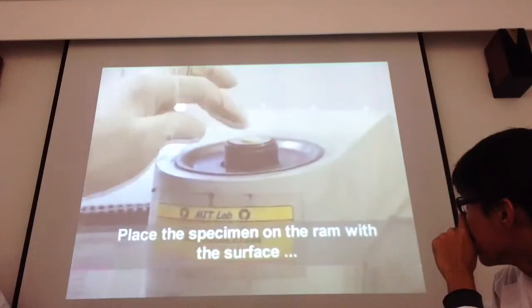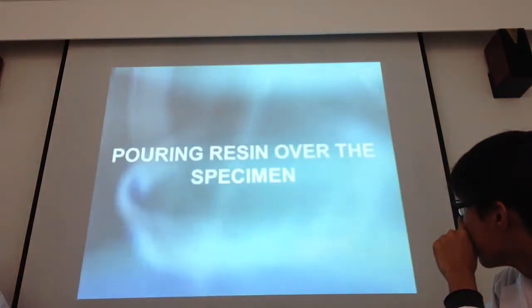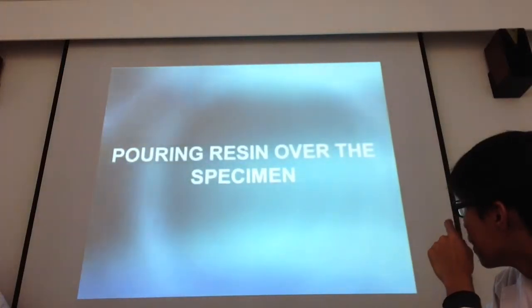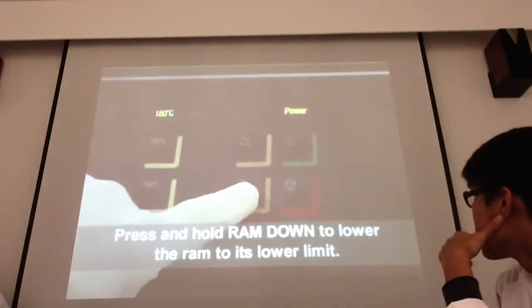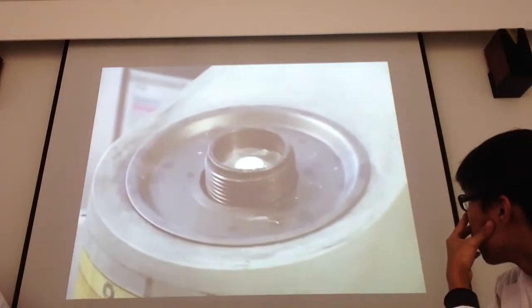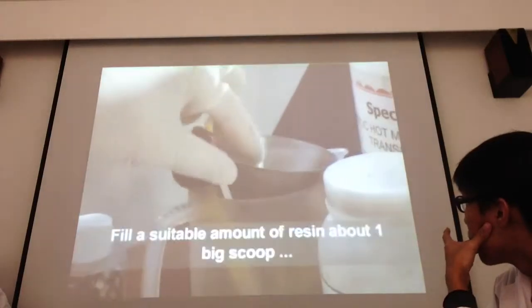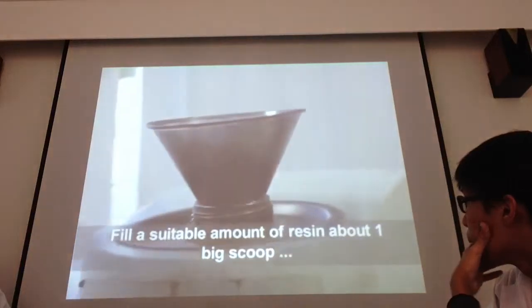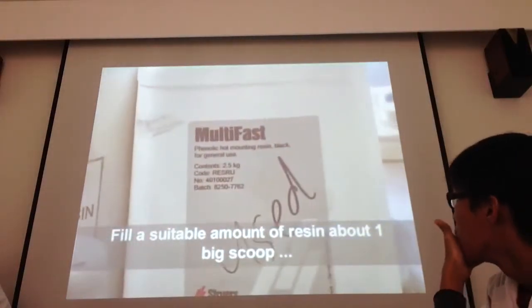This one is your sample, the material which you have already cut into smaller pieces. Lower down the ram to make space for your resin, so that you can expand. When you are taking the resin, try not to be greedy.